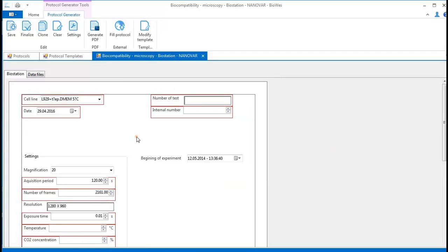You need the plugin, but it can be created by us. Or if you have some programmer or you are the programmer, then we have the open interface, so you can implement the software yourself. So this is the information about how we can communicate with the measurement devices.